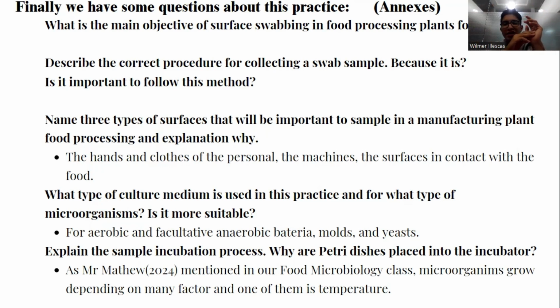And then you put this jelly into a glass bottle which is polluted, and you didn't notice that because you thought, well, they were very well the last time that we analyzed them, but you didn't notice that there was a pathogen, and all of those issues that sometimes happen. So therefore, later, there are going to be problems, and that's not going to be innocuous.